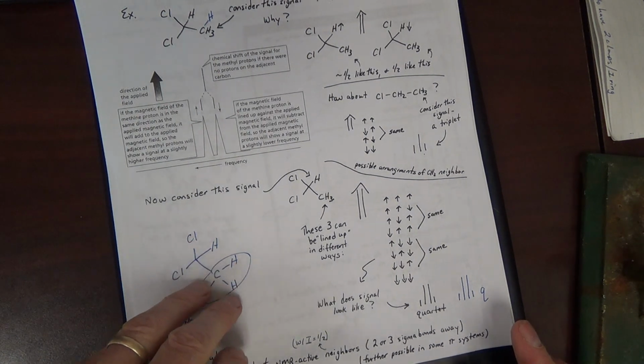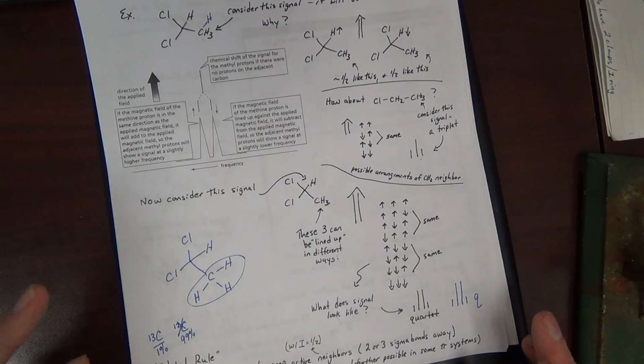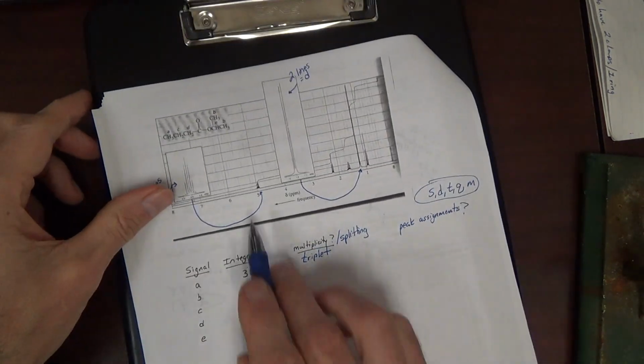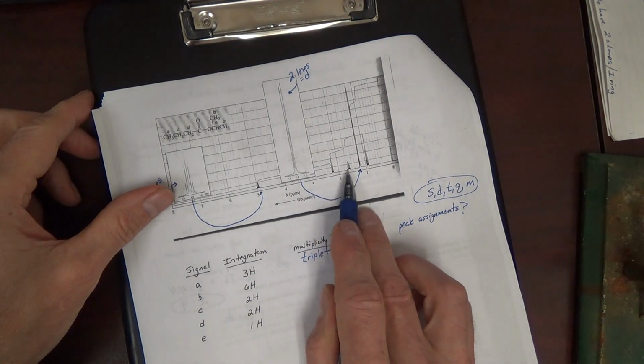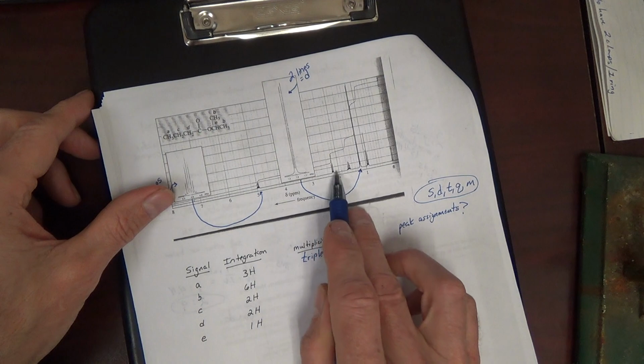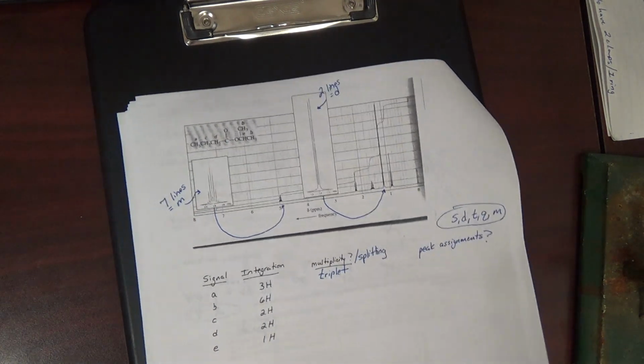Okay, splitting, very fascinating, but the splitting is also very useful. Very useful, because you can just look at the splitting and you can tell. What can you tell? You can tell how many neighbors are there, because the neighbors do the splitting.